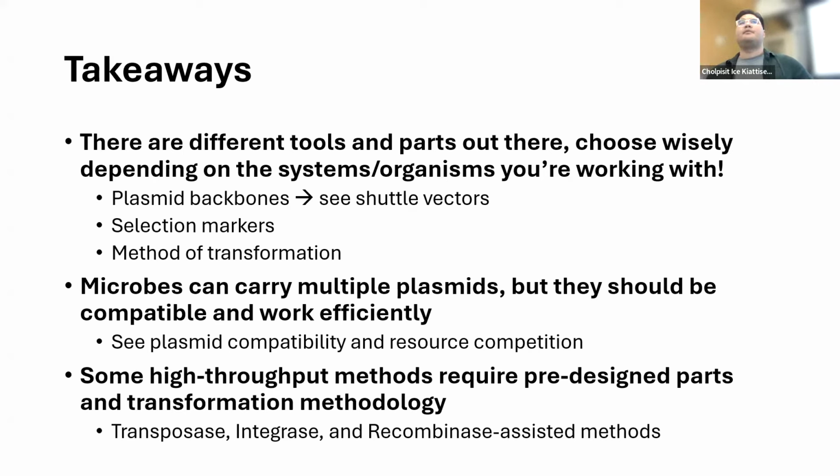And most of the time, the way that the bacteria fight with these molecules is dose dependent, and adding more doesn't always help. There's always a chance that you can decrease them. Let's say you are using two antibiotics for selection and you've been using the regular concentration so far, and you can't really get these things to transform effectively.